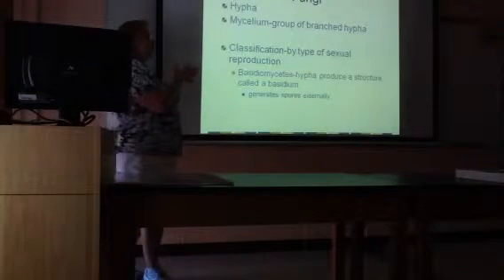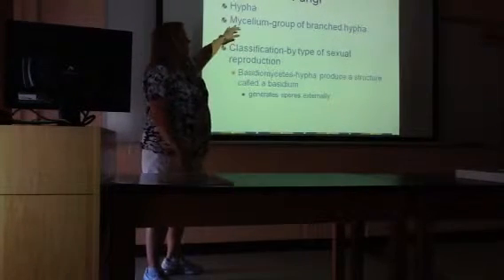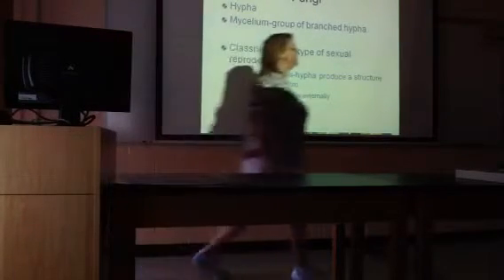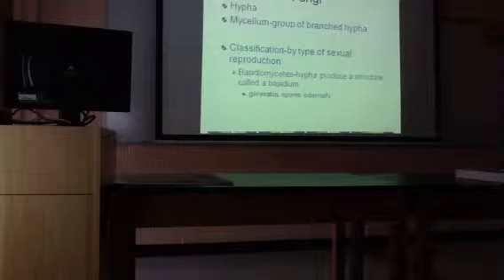And when they're all overlapped in that big clump, we have another term, mycelium. So hypha is one strand of fungus. Mycelium is when a bunch of them are together.